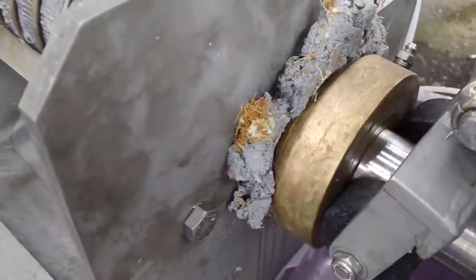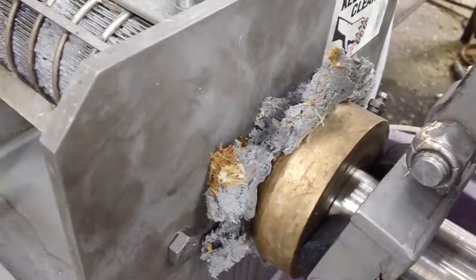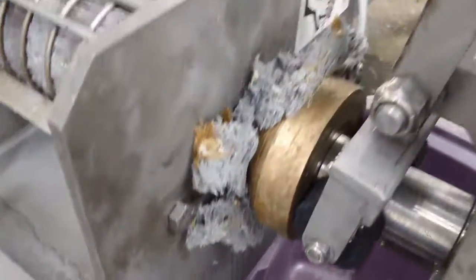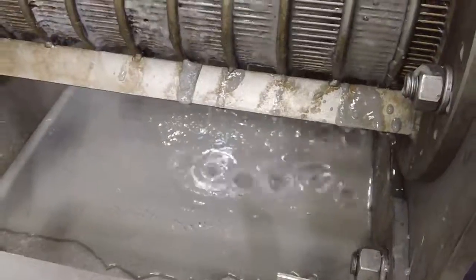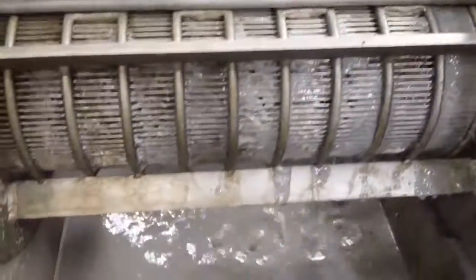A little residual material from the previous test — I tried to get it all out, just a tiny bit, no big deal. There is a bit of solids escaping with the liquid through the screen.